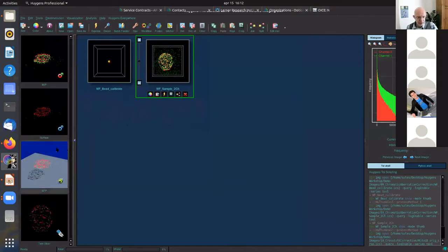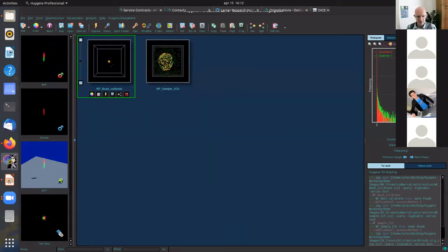Okay. So let's now fix this. And how to fix this? Of course, you can sometimes do that on your biological data if there's some correlation between the two channels, but this is dangerous, of course. This is that you assume that there should be an overlap. The best way is to measure something that you know.